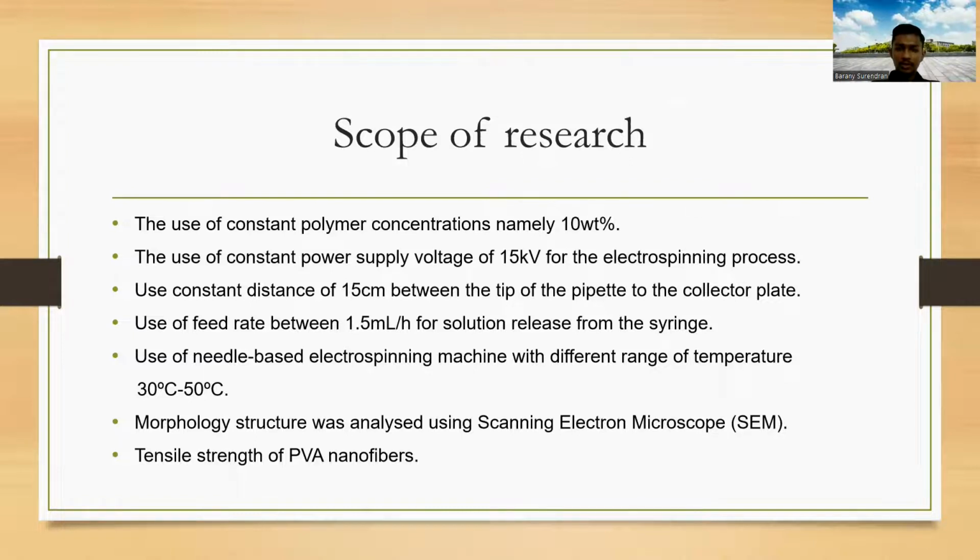For this research, the morphology structure was analyzed using a scanning electron microscope, SEM. The final one is to find out the tensile strength of PVA nanofibers. There are four parameters that I kept constant based on previous studies, which are concentration, power supply, distance, and feed rate.